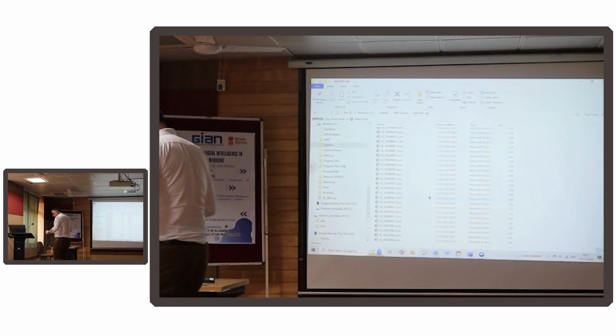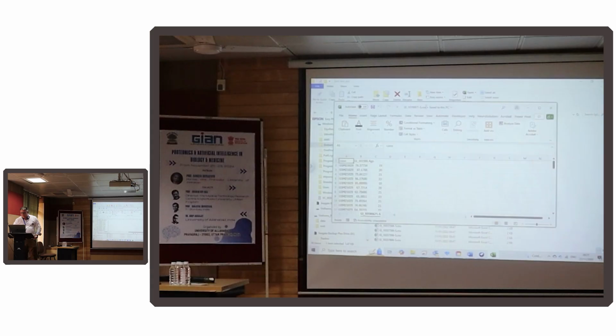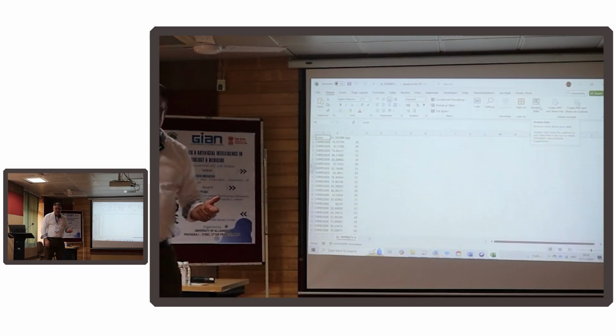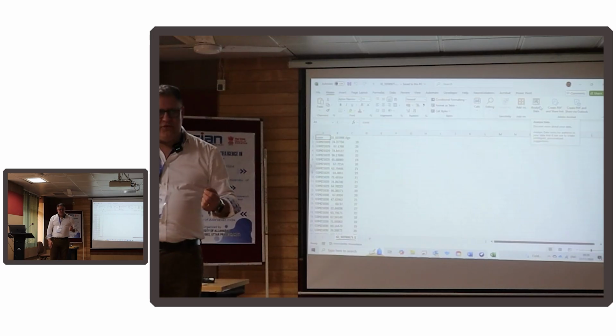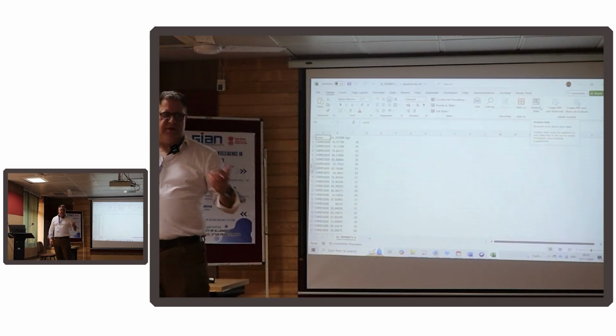So, what these individual files look like is this. It's literally a column called case, which is the individual in the population. Within that we can randomize as well, and we will. We've got the expression, and the header of that column is the gene name, and this is using GI notation. And then we've got the column header for the age of the person who gave the muscle sample.